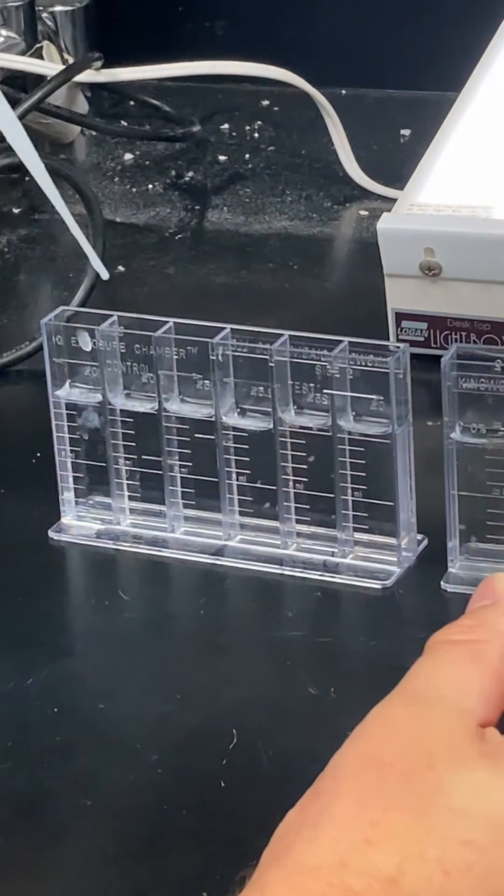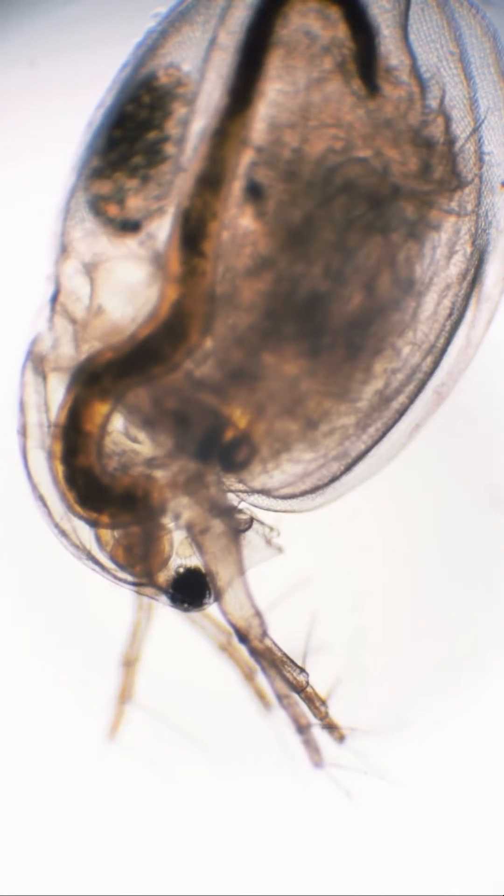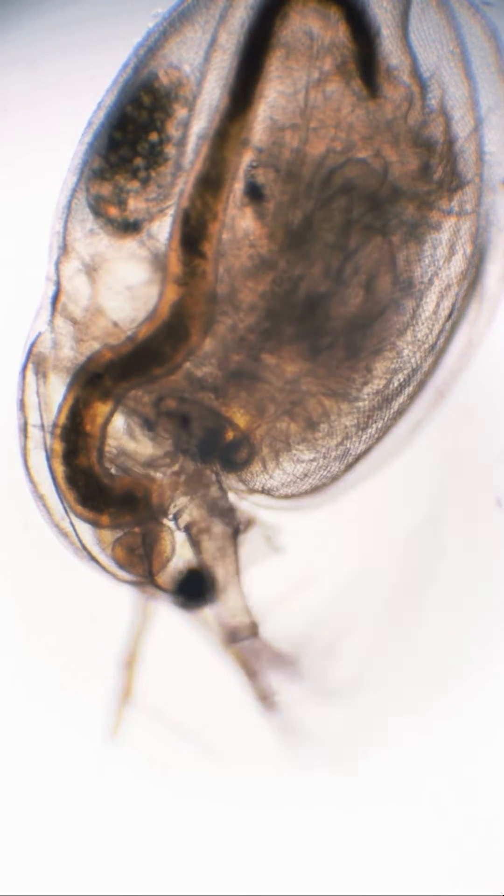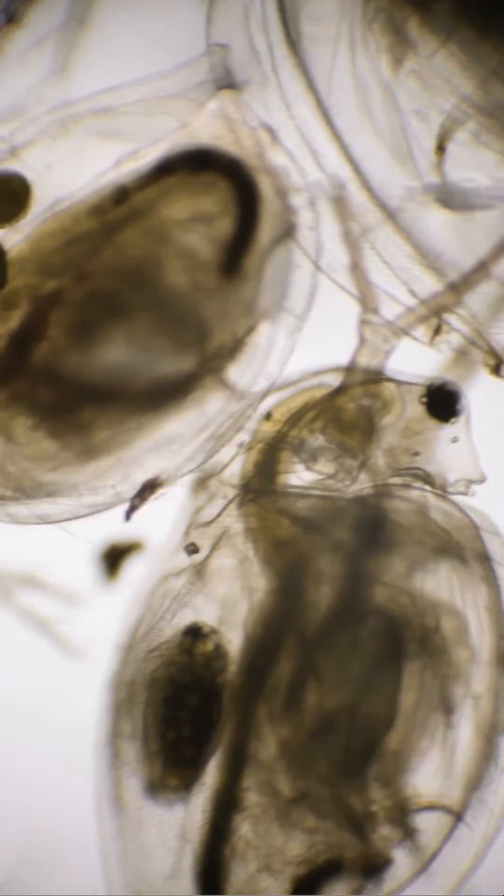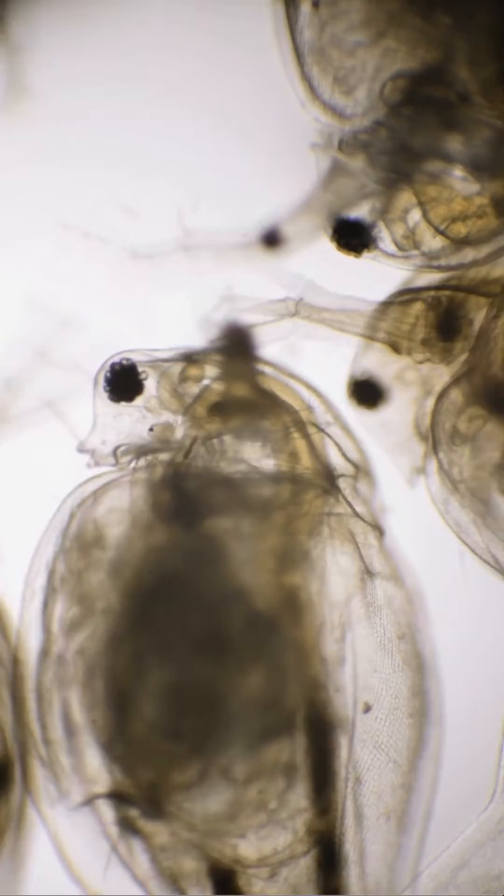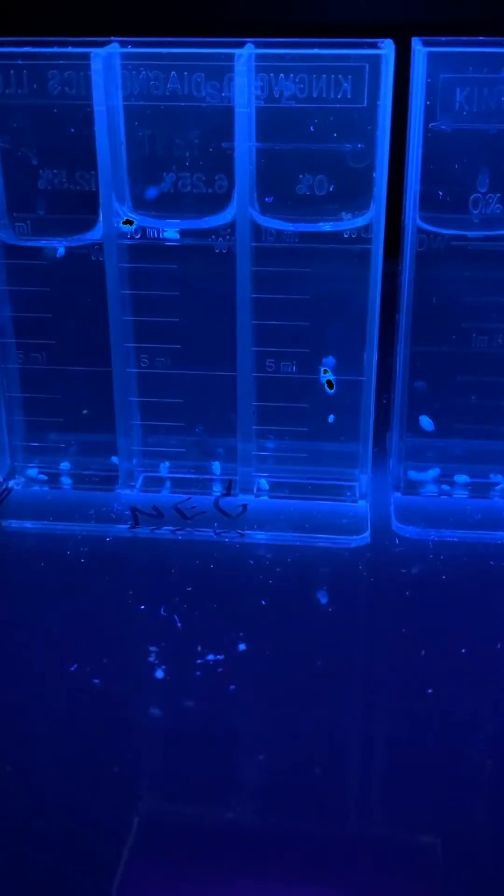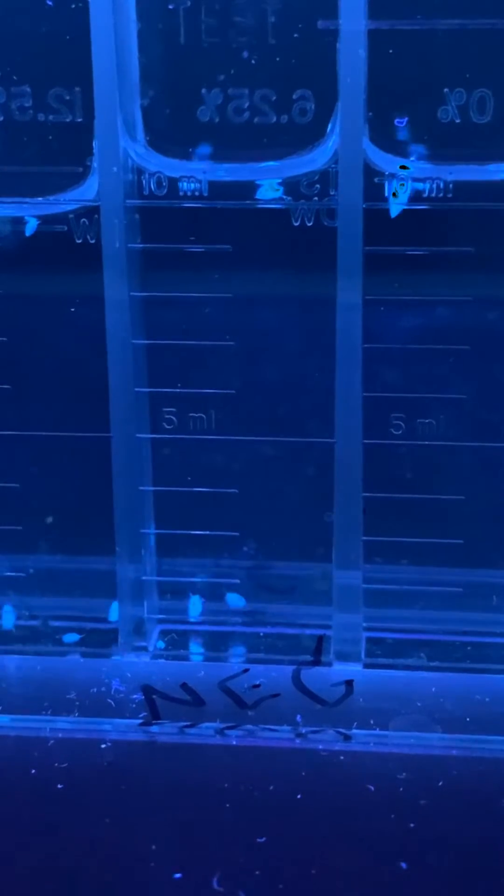The test is based on the idea that if a cladoceran or water flea is impaired, it will not eat. After an hour in potentially impaired water, if it's negative, they will eat and fluoresce because the sugar substrate has a fluorescent tag in it.